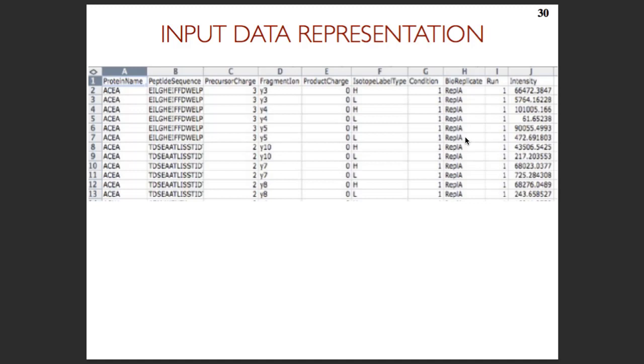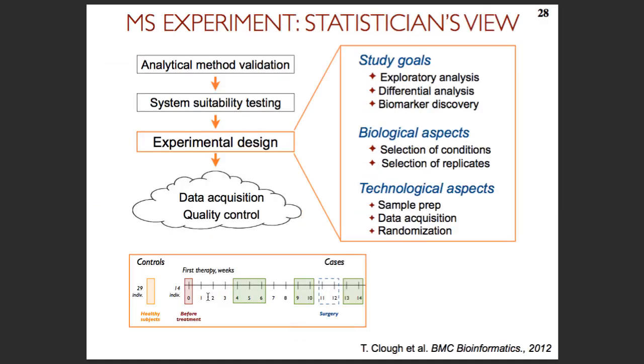That's right. So it's not like there's a finite number of different models. MSstats does not invent models from scratch, right? So essentially it's an if-else statement, right? If it's a group comparison, fit this model. Else, if it's a time course, fit this model. So the number of models is finite and they're all well documented, so it's not like you will end up with some surprise, right? But the model will be adapted to the design which you have at hand, including one like this, which has a combination of group comparison and a time course, and it will do the right thing in the background.